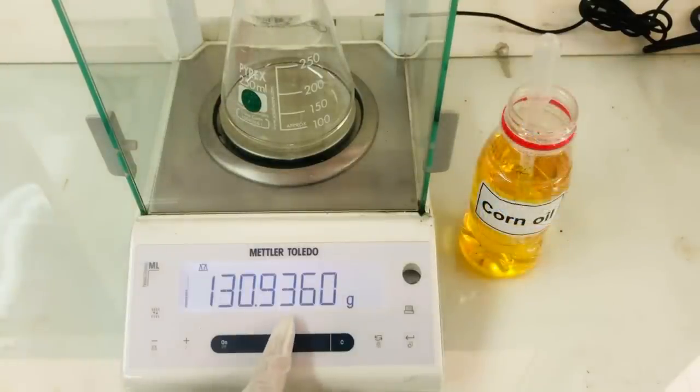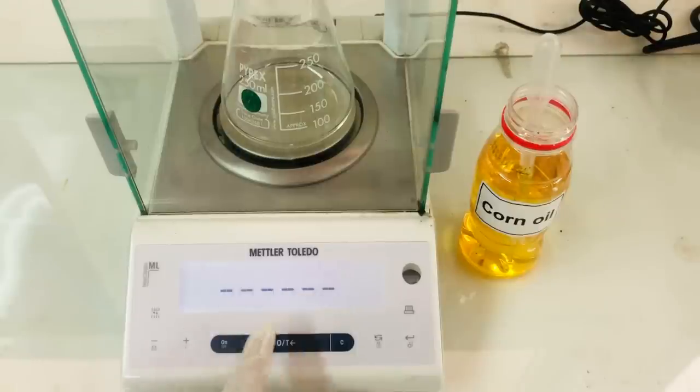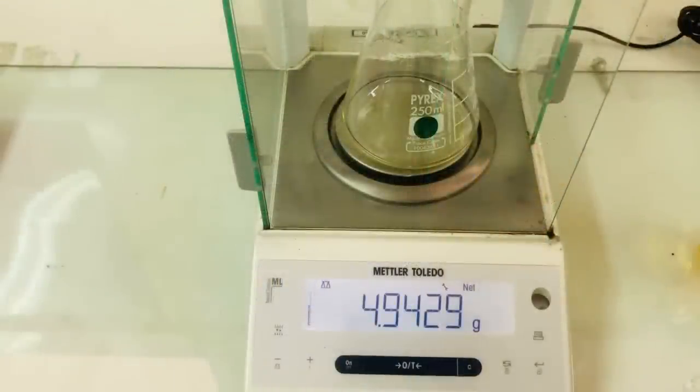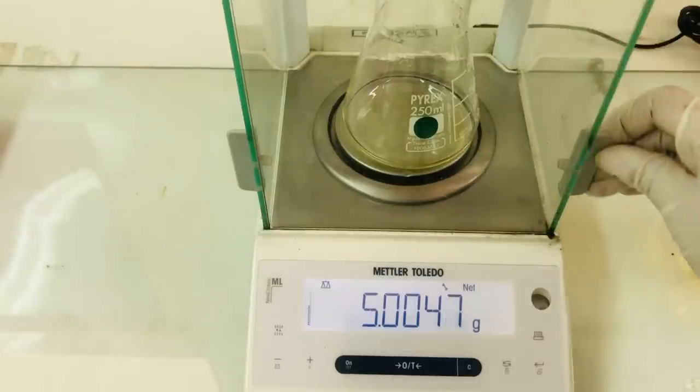For this, we will press stir and we will make it zero. Now we are going to put 5 grams of oil in the conical flask. We will adjust the weight so that we can have exactly 5 grams of the oil sample.